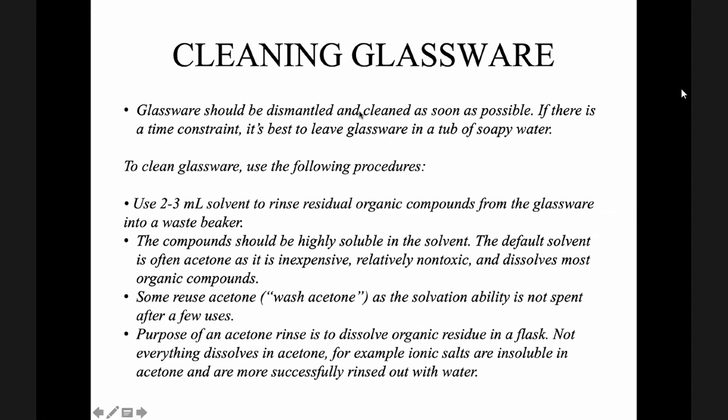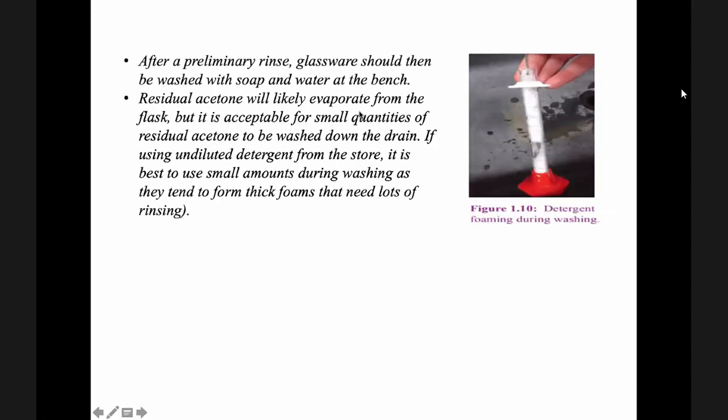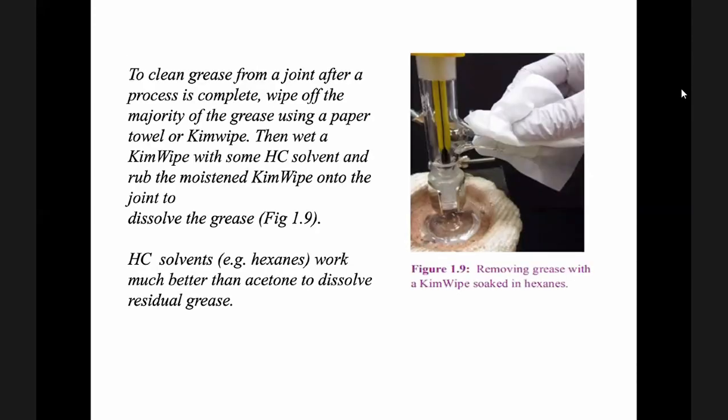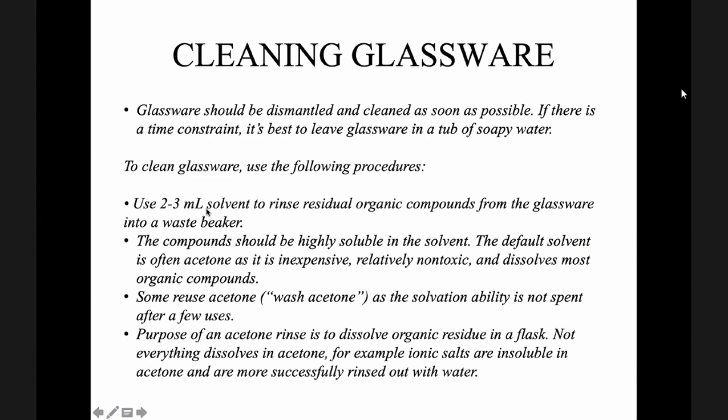Okay, how do you clean these glasswares? You can use 2 to 3 ml of solvent to rinse residual organic compounds from the glassware. You can use acetone, because its solvation ability is not spent after a few uses. After that, you can reuse it again. So the purpose of the acetone is to dissolve organic residue in a flask.